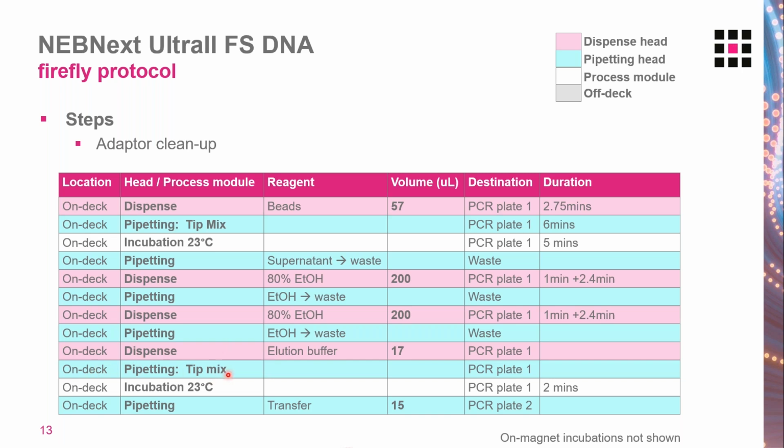One other thing to point out is that after dispense of our elution buffer to the reaction plate, we found that it was better to tip mix at this point. We did try shaker mixing. That was okay, but tip mixing gives us a better result, just a more even mix, which was successful in every single well.